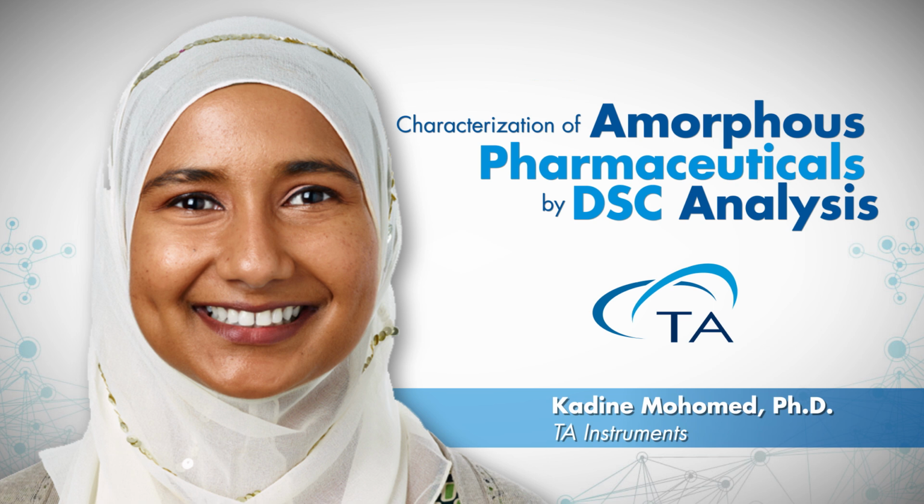Does the powder preparation tool come with the die kit, or is it purchased separately? So it is not a standard part of the DSC, or I should say Tzero press kit. It's a separate part number, and what we can do is include the part numbers on the resource link of this webinar once the webinar is complete. Okay, great. I would say that that powder prep tool has helped me tremendously.